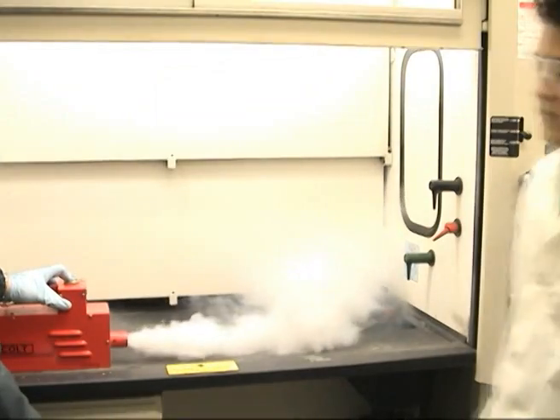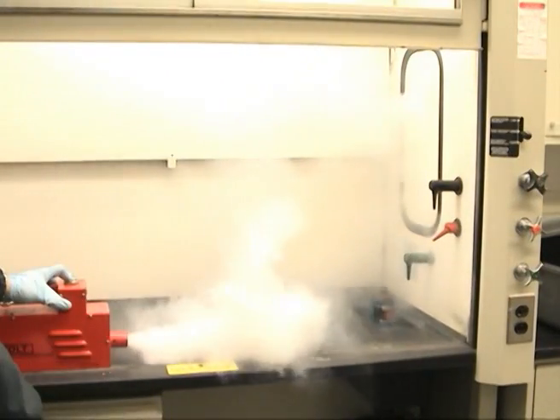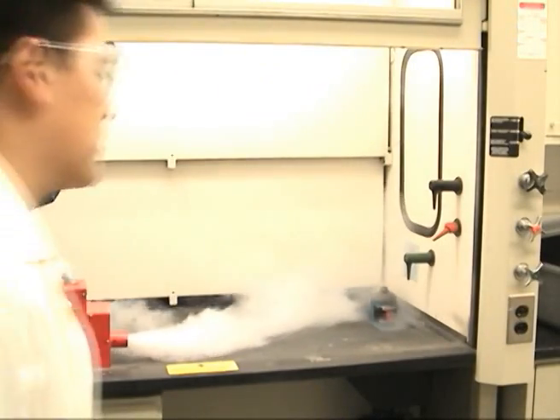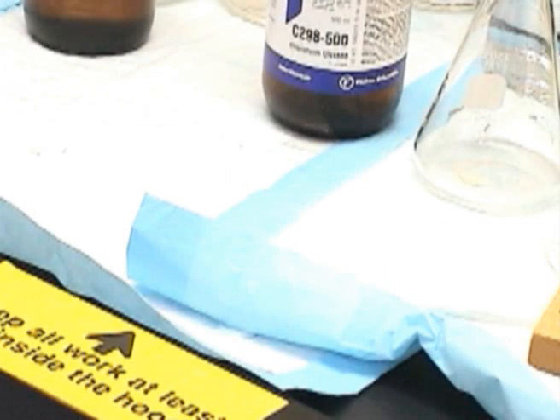Airflow turbulence at the front edge of the hood can draw airborne contaminants out of the hood. In this case, the sash is too high, and when someone walks by, the low inflow velocity allows the smoke to come out of the fume hood. Sashes properly adjusted and working further into the hood are the best way to protect yourself from inhaling hazardous chemicals used in the hood.